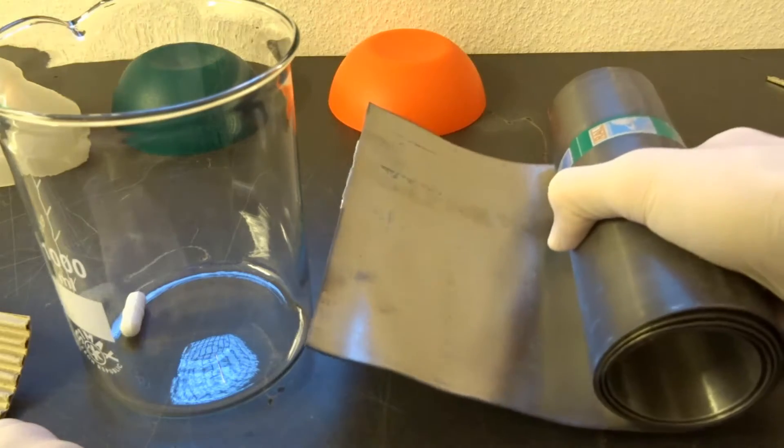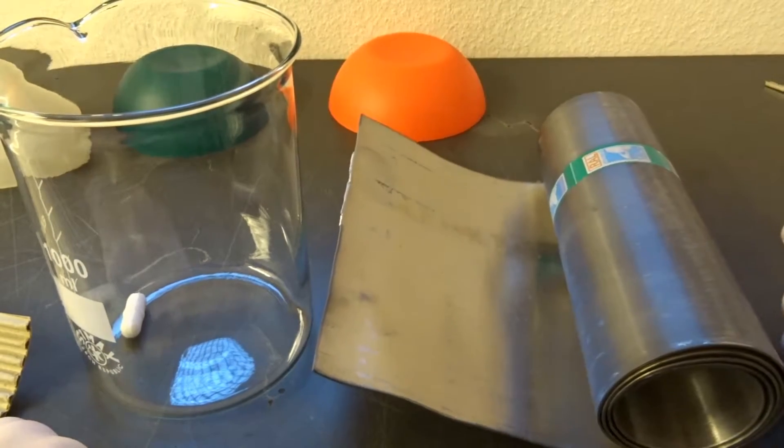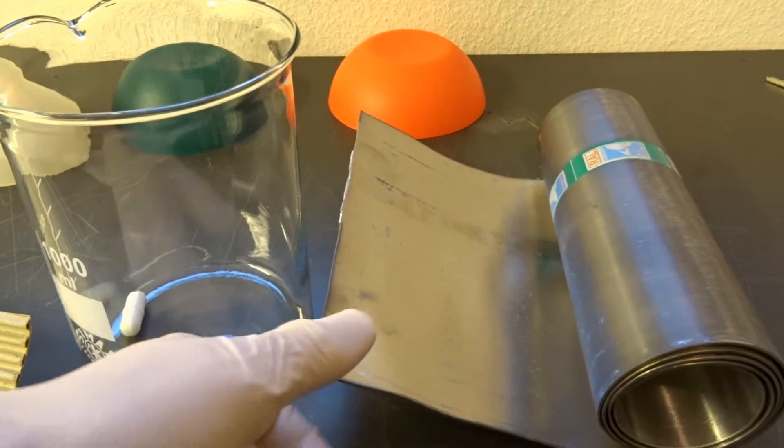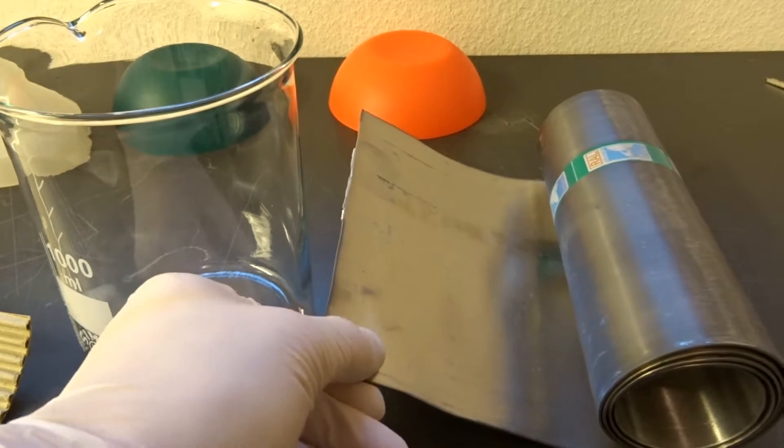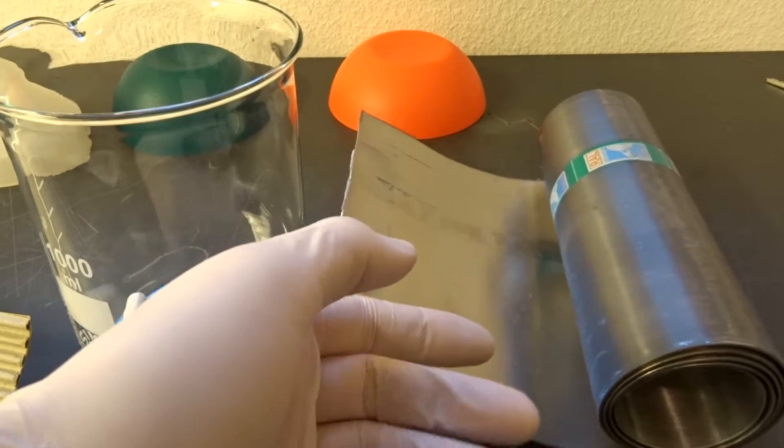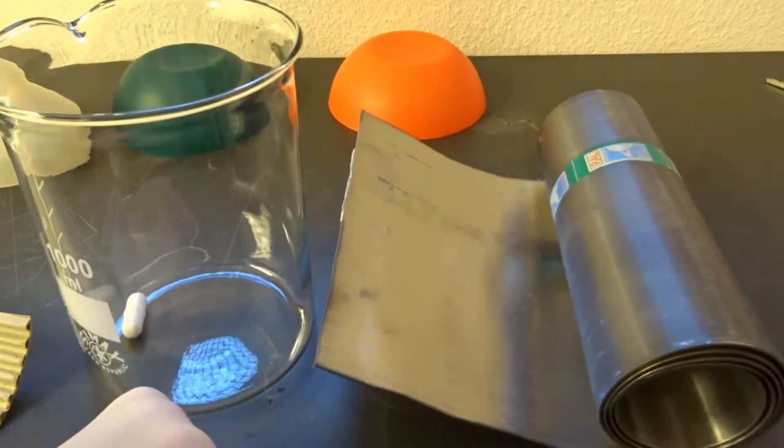Believe it or not, this little roll here is around three kilograms, so it's really a super dense metal. This is lead roofing, and it's pretty good in thickness and height already.